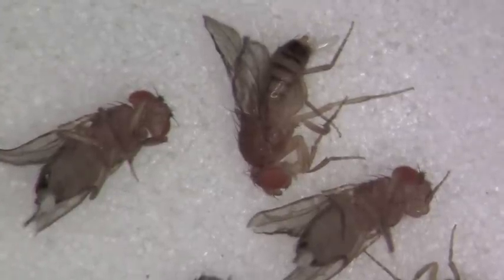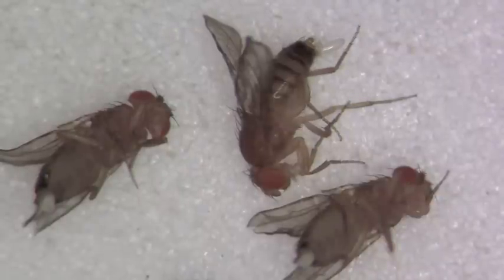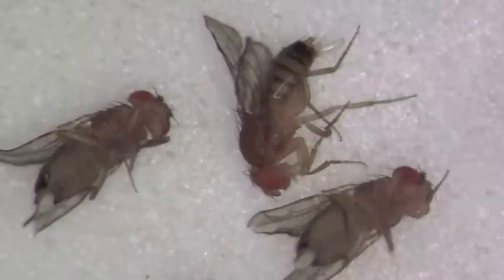Here's a field of three female flies. Each female is ejecting an embryo from her posterior end. Notice the pigmentation in the abdomen — that is a major difference from males. Here's a couple more females.